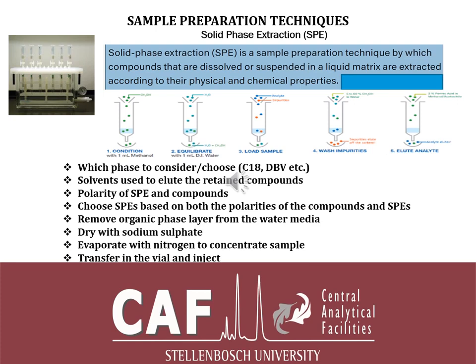Or solvent of interest, and then also you can do derivatization on the SPE in terms of thiols and other analyses, where the derivatizing agent is added into the aqueous sample, and then it is absorbed on the SPE, and you elute it. So there's a lot of things that you can use it for. Also bear in mind there are different polarities of the SPE, and you can find a lot of information out there from the supplier of the SPE, or one can check on the internet. There's a lot of information about that.